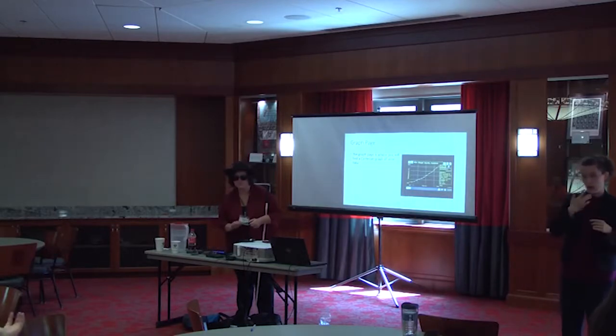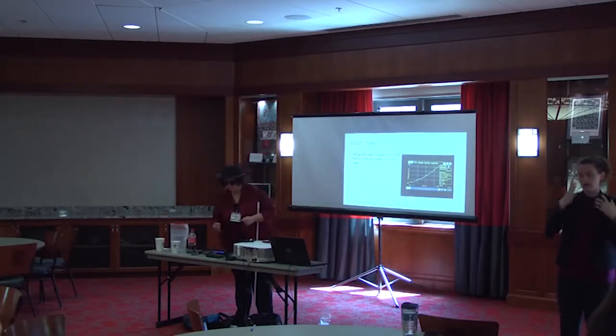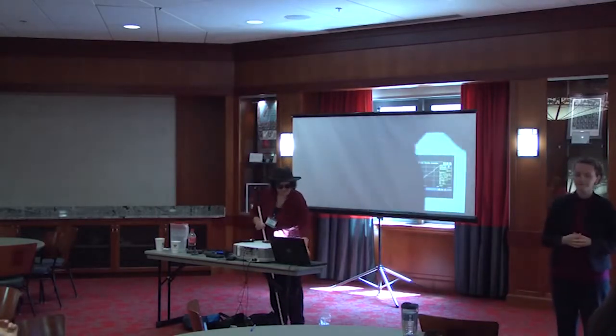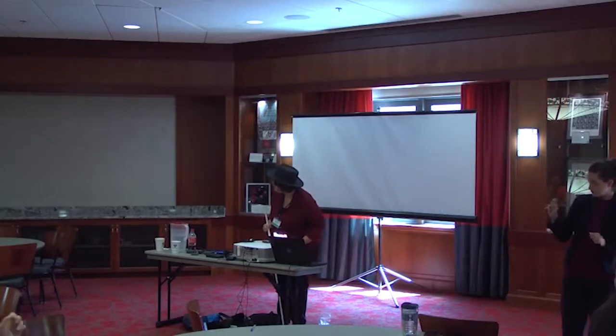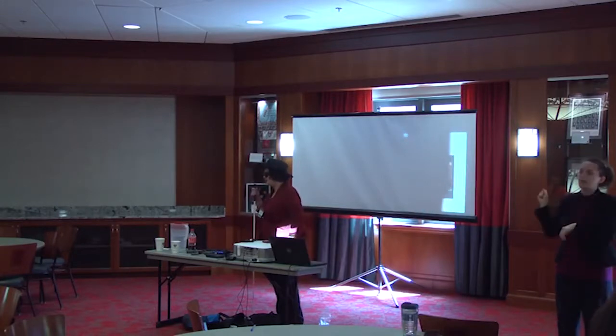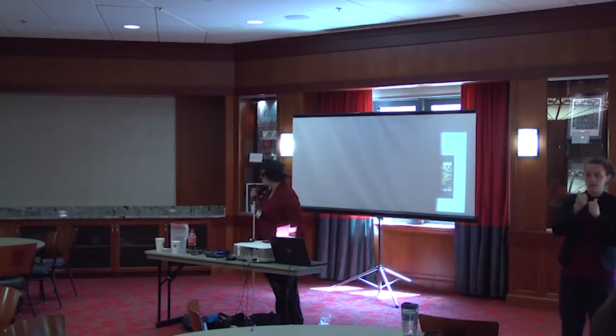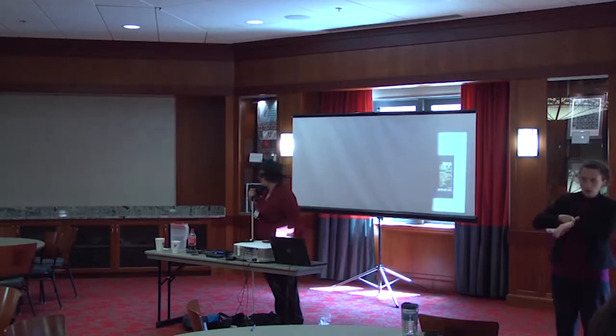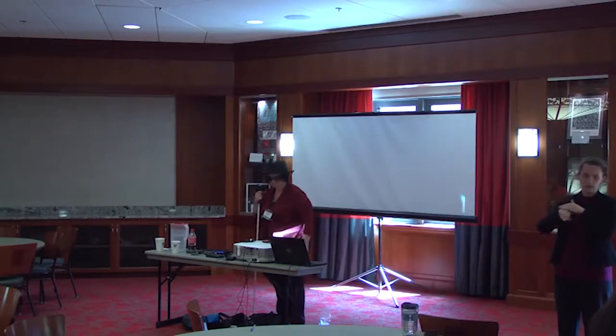So then we can go back up to the Sensor page, detail box, data collection, graph page, push button, run selector, push button, store run, plot details box, run 1 temperature. So on this page, we always emphasize to students, especially the younger ones, that this is not to do your math for you.